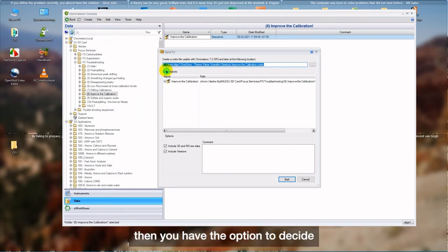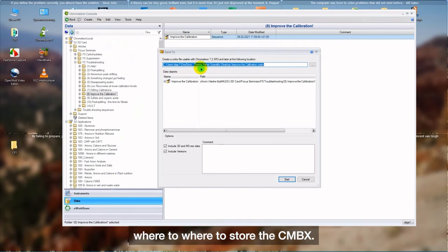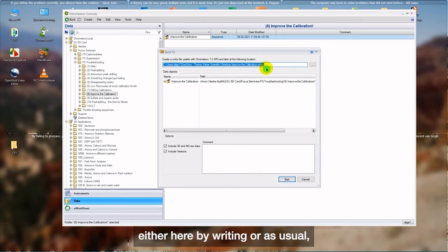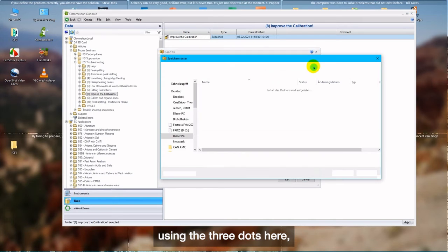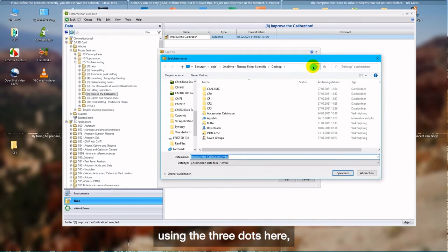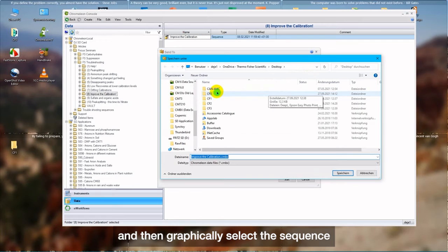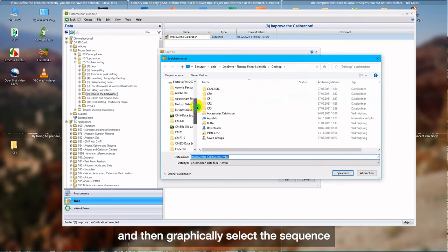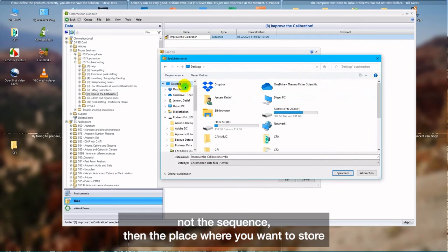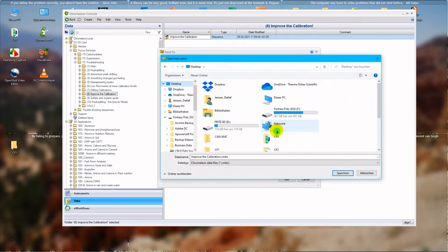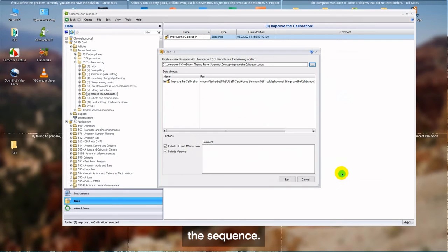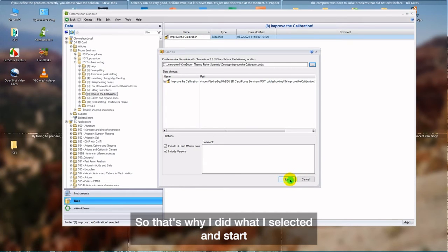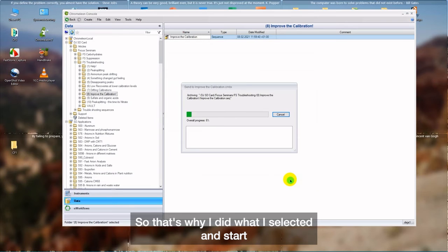Then you have the option to decide where to store the CMBX. You can define the path either here by writing or, as usual, using the three dots here. And then graphically select the sequence, not the sequence, the place where you want to store the sequence, like I just did. And I want to store it on my desktop. So that's what I selected. Say Start.